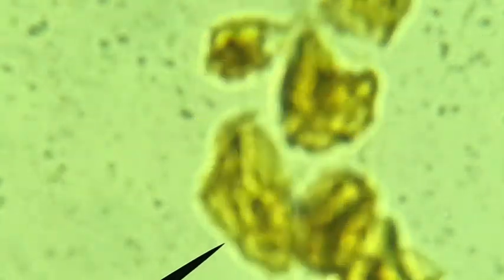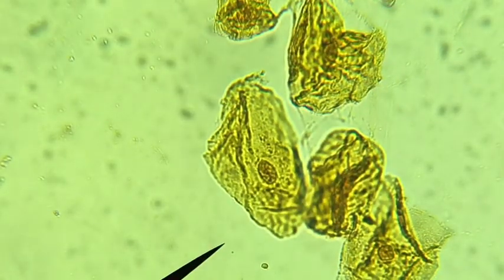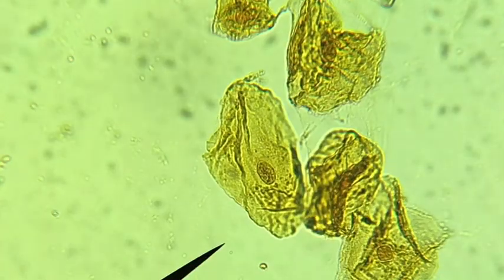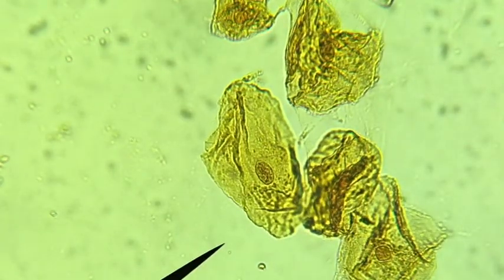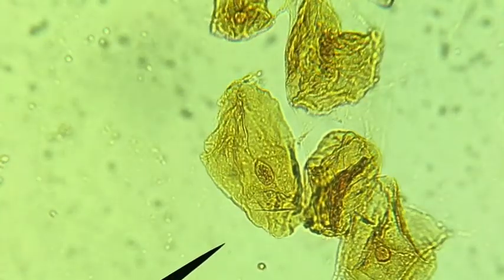Under high power you can see the cell membrane, and obviously the cytoplasm is in there, along with an obvious nucleus as well. You can't really see the other parts like the mitochondria, Golgi apparatus, or endoplasmic reticulum very well — those things are harder to see.